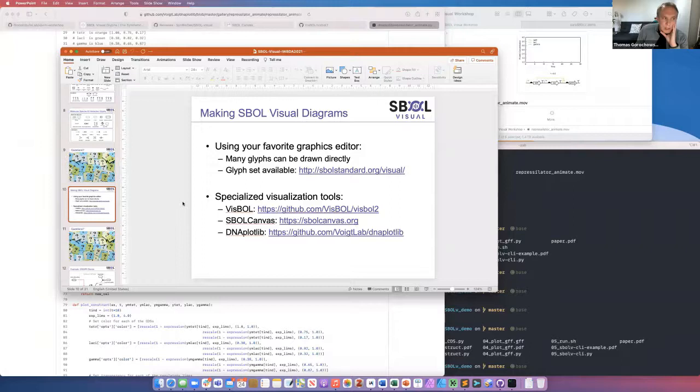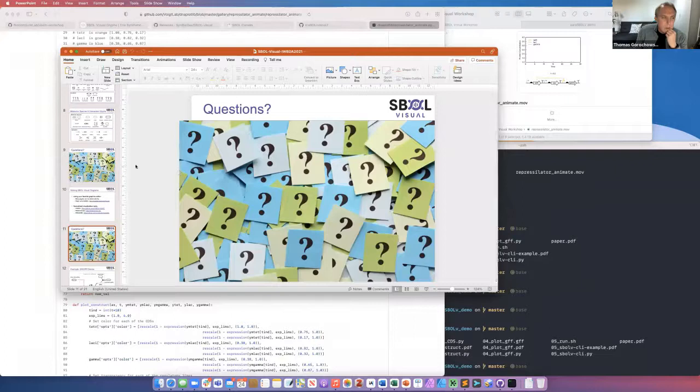They might be able to help you out. But I think the tool is complete, but it might just be that you have to use some of the additional functionality that's within it if you need multiple backbones. And I know it will do that because I've seen examples where that's possible. So I don't think it's a limitation of the tool. I think it's just that your code may have to actually implement some of that functionality itself. And that's it in terms of questions. Are there any other questions on this aspect? No.